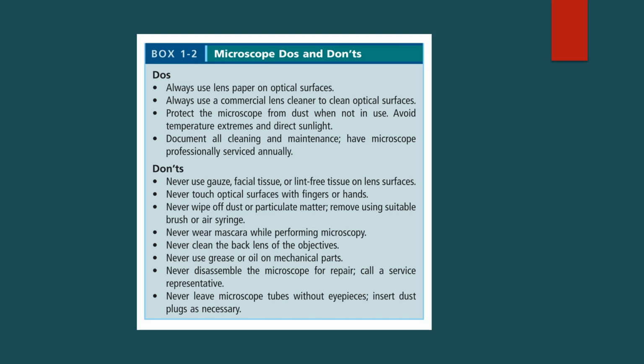Do not do this: never use gauze, facial tissue, or lint-free tissue on lens surfaces. Never touch the optical surfaces. Never wipe off dust or particulate matter; remove it using a suitable brush or syringe. Never wear mascara when performing microscopy because it will attach to the lens of your eyepiece.